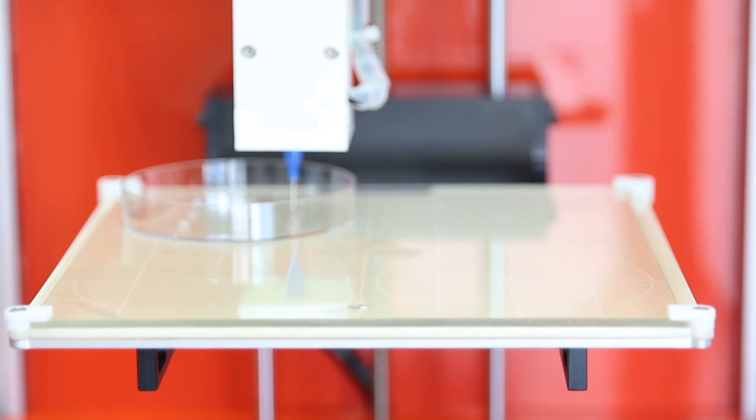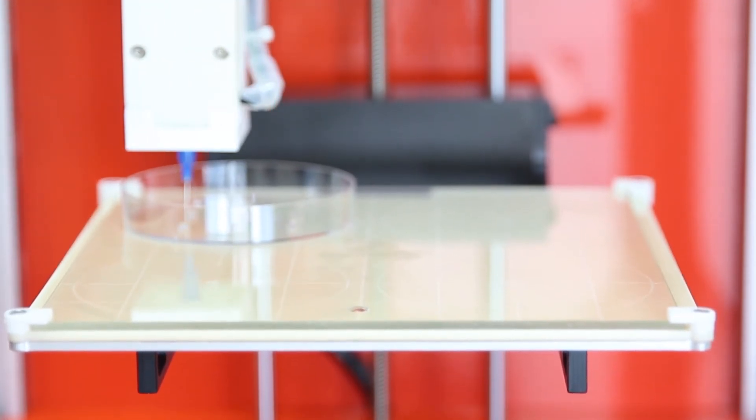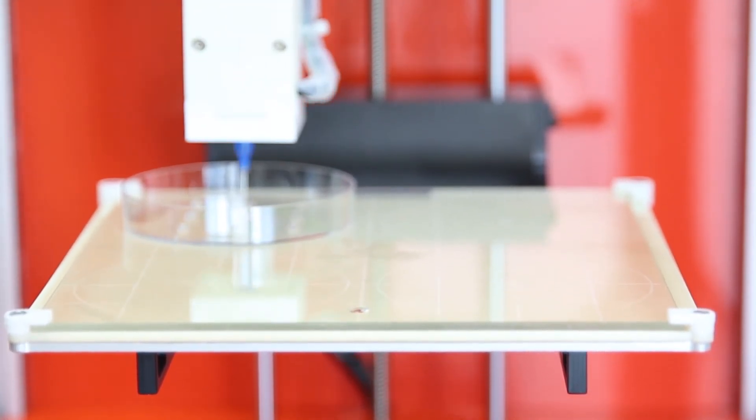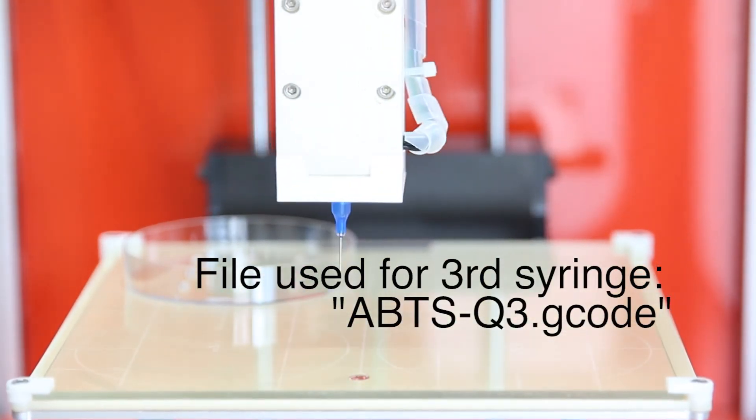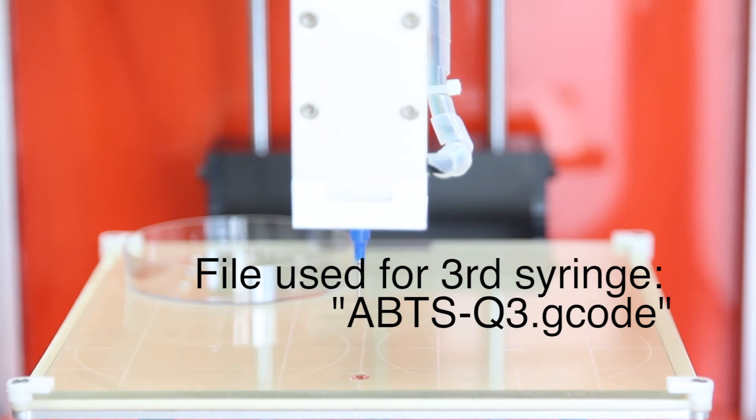Once the alginate syringe has finished printing, you will repeat the same steps to print the ABTS syringe, by priming the syringe, loading the ABTS file, and printing.